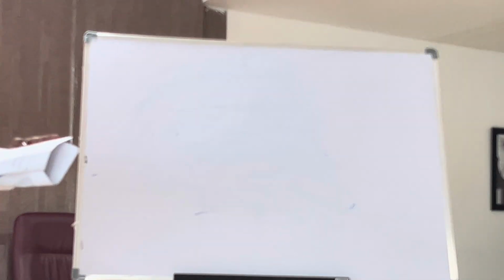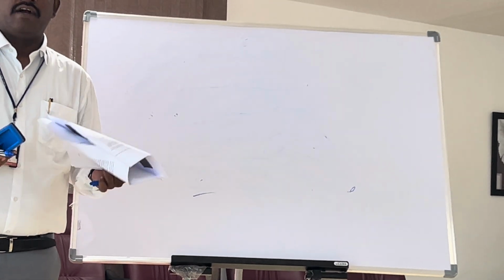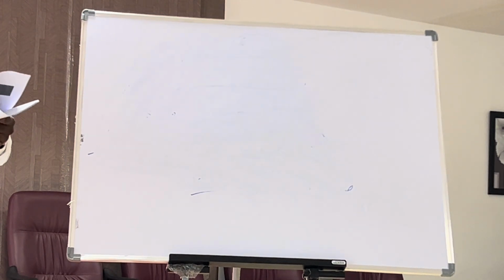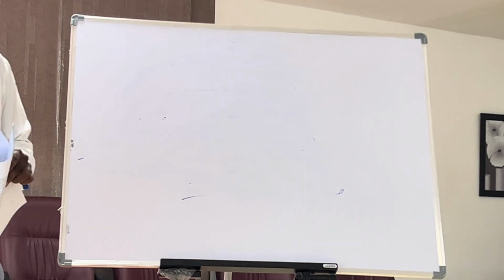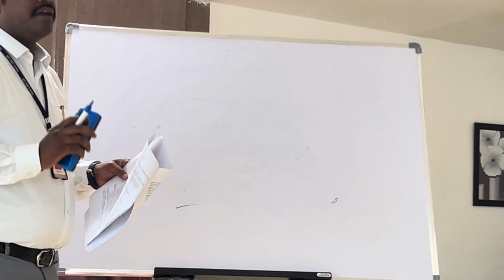And the most important thing: this is mostly used in the wet lab, for those who are working in the wet lab area, which is very useful. But the ppm solutions are useful for everyone. Even if it is not a wet lab, whether it is chromatography, GC, or LCMS, anywhere you work, ppm solutions are very, very important.